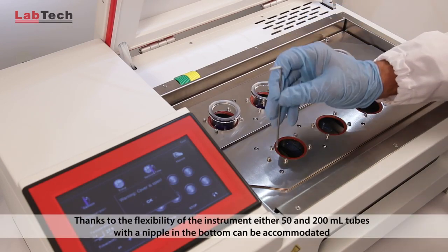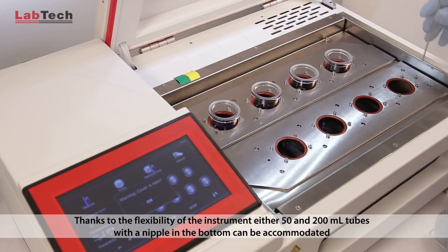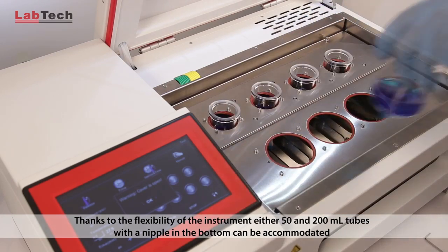Thanks to the flexibility of the instrument, either 50 and 200 ml tubes with a nipple in the bottom can be accommodated.